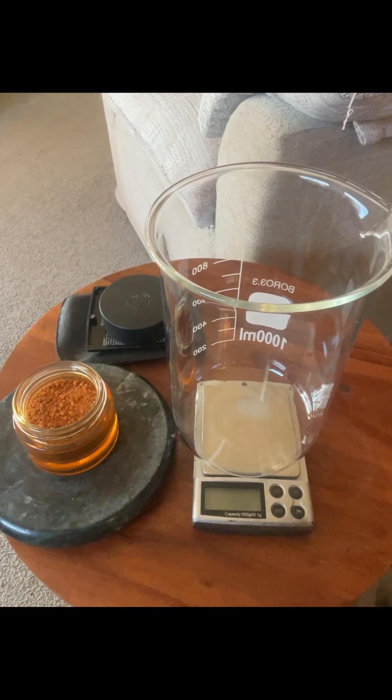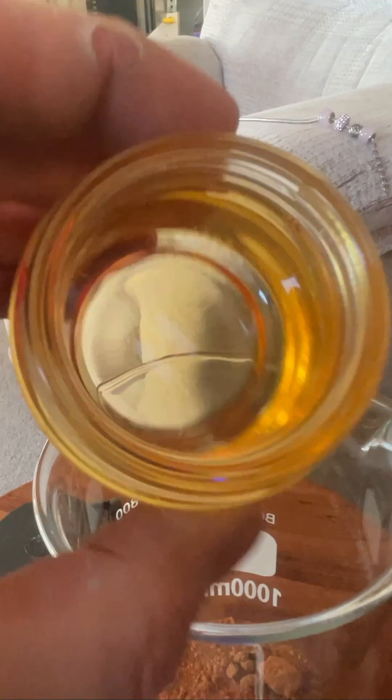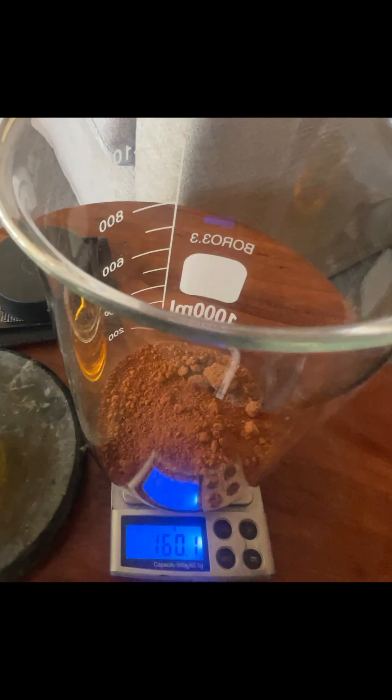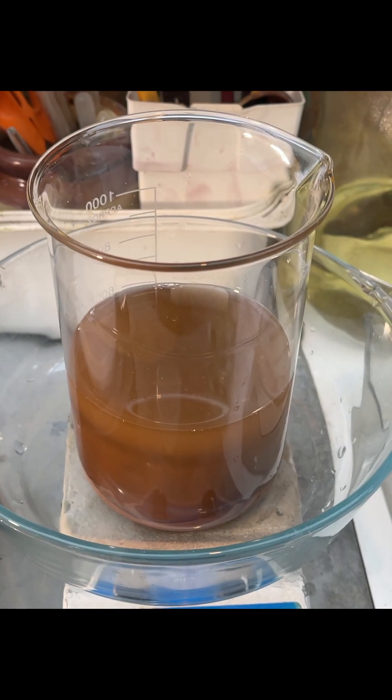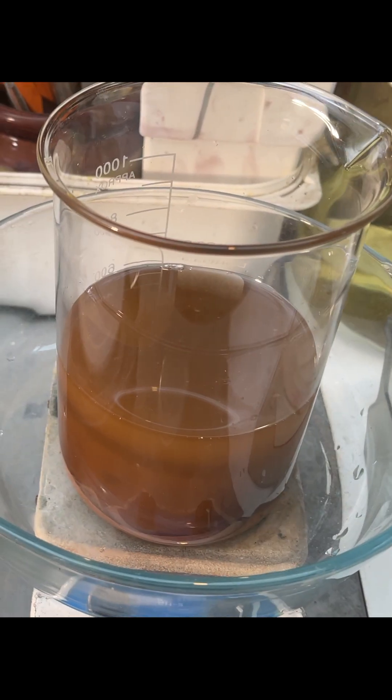Today I'm going to refine over four ounces of gold and then make some bars. 160 grams there, so we're going to get that into aqua regia — I've just added hydrochloric acid and I'm just going to put a small amount of nitric acid in there.